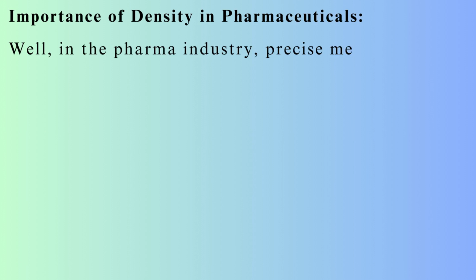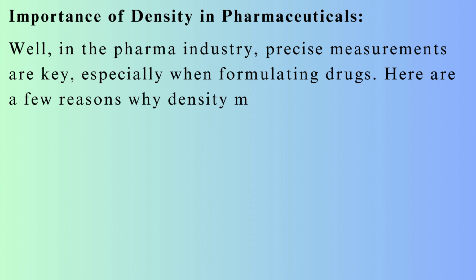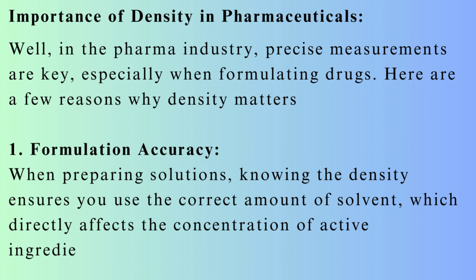Importance of density in pharmaceuticals. Well, in the pharma industry, precise measurements are key, especially when formulating drugs. Here are a few reasons why density matters. Formulation accuracy. When preparing solutions, knowing the density ensures you use the correct amount of solvent, which directly affects the concentration of active ingredients.